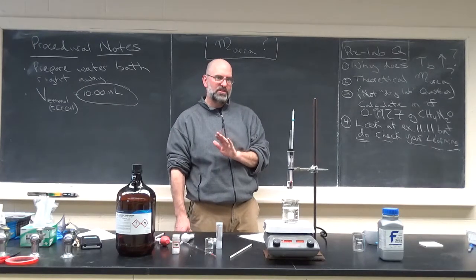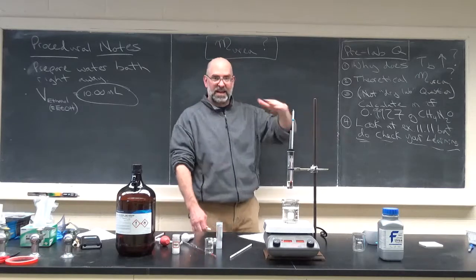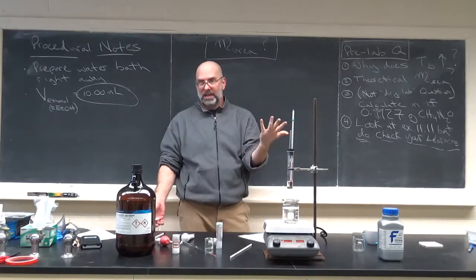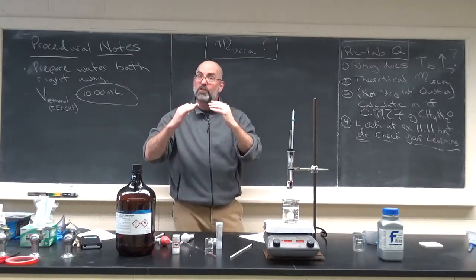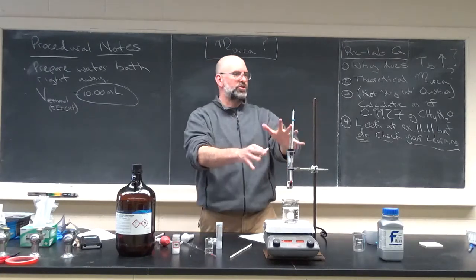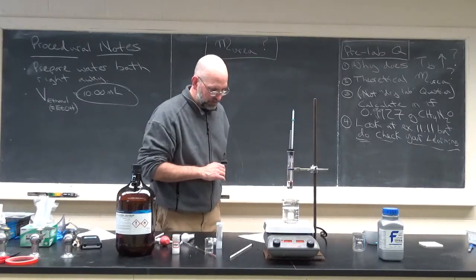If your instructor has you set up a calculation section, which you always do, you can actually use this example and set up your calculation section ahead of time, so that when you write your lab report, you just kind of follow along. You've already got the recipe written out just for efficiency's sake. This lab is a lot of work at the front end. It's a little bit tricky to get the data. It's pretty quick to write up, so it'll be pretty straightforward.